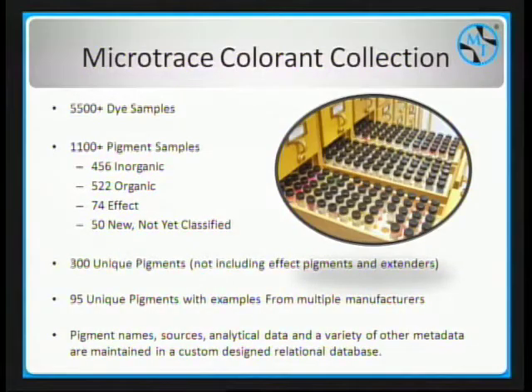So our colorant collection at Microtrace, we've always been really big on collecting physical reference samples and having them and characterizing them, and it helps us to understand how to analyze materials better and how to apply analytical methods more appropriately. But we have over 1,100 pigments in our collection now, and you can see how it's broken down.